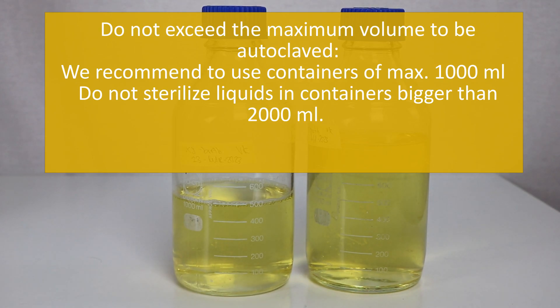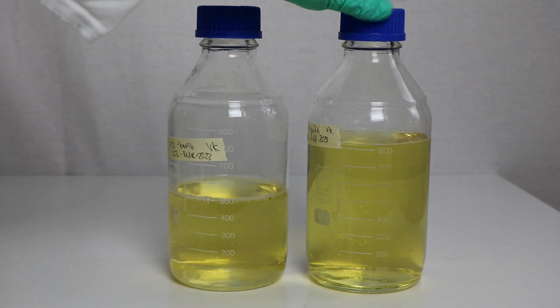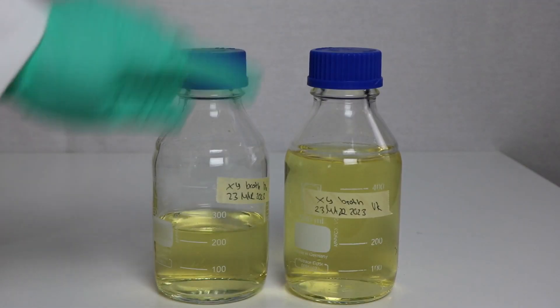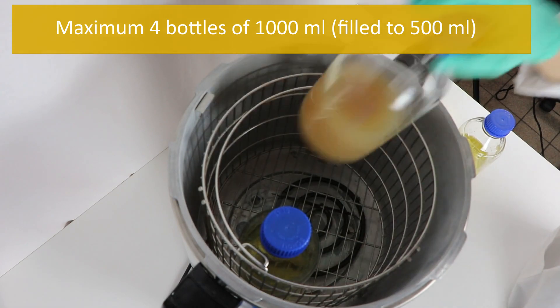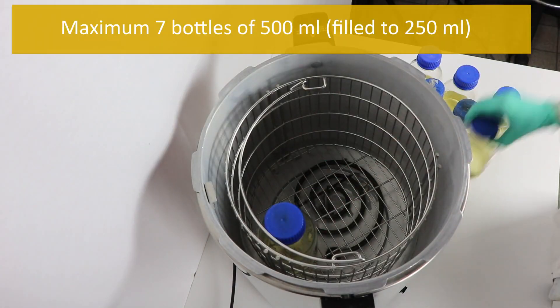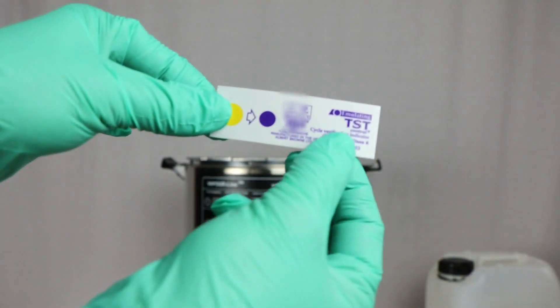Do not tighten the bottles completely; loosen the screw caps. Do not exceed the maximum volume to be autoclaved. We recommend using containers of maximum 1000 milliliters; do not sterilize liquids in containers bigger than 2000 milliliters. Bottles of 1000 milliliters should be filled to maximum 500 milliliters; 500 milliliter bottles should be filled to maximum 250 milliliters. Autoclave a maximum of four bottles of 1000 milliliters (filled to 500 milliliters) or a maximum of seven bottles of 500 milliliters (filled to 250 milliliters) at the same time. Attach steam sterilization indicators.